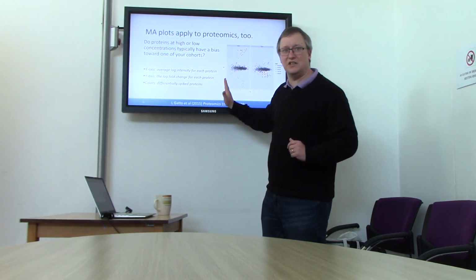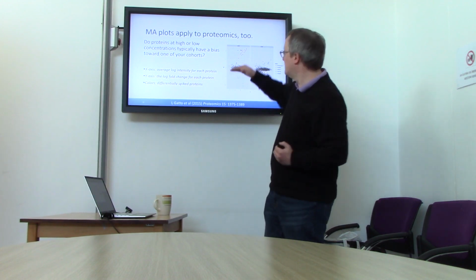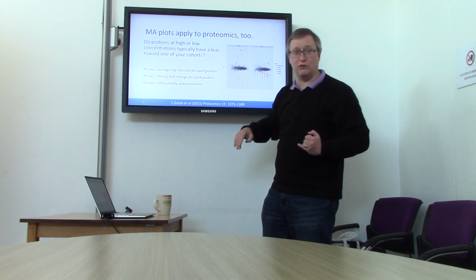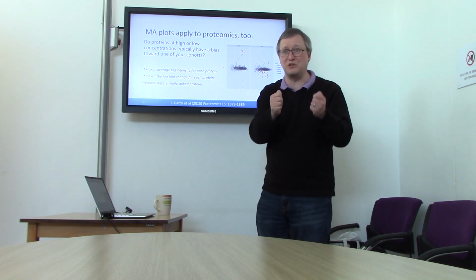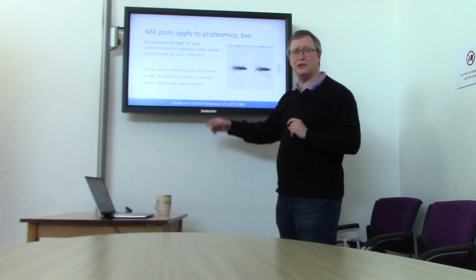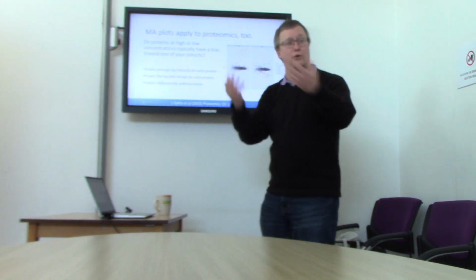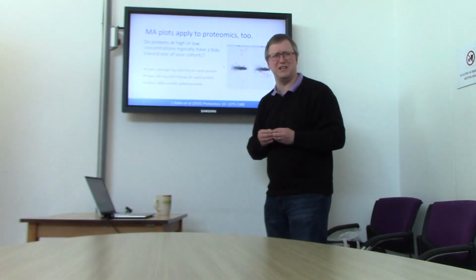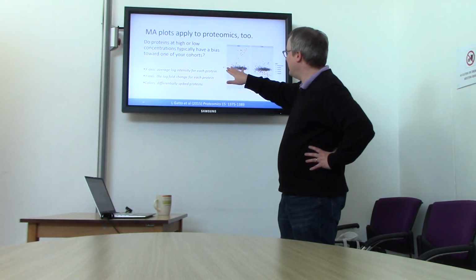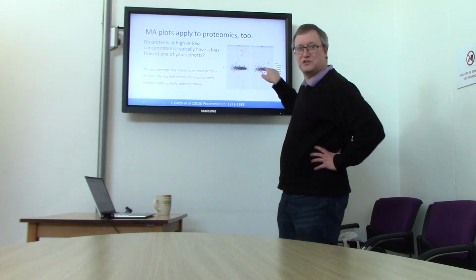So up and down in this case is to say more present in one cohort or more present in the other. Something sitting around 0 is at a log fold change of 0, which is to say a 1-to-1 ratio between the two. These data came from a cool paper by Laurent Gatto explaining the tools we have in R for visualizing proteomic differences. It's a really interesting, good visualization paper. So here we've got an MA plot for the 4 versus 2 experiment. This is an MA plot for a 6 versus 2 experiment.